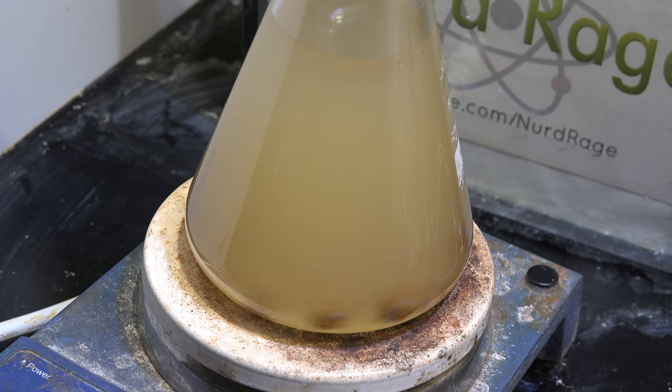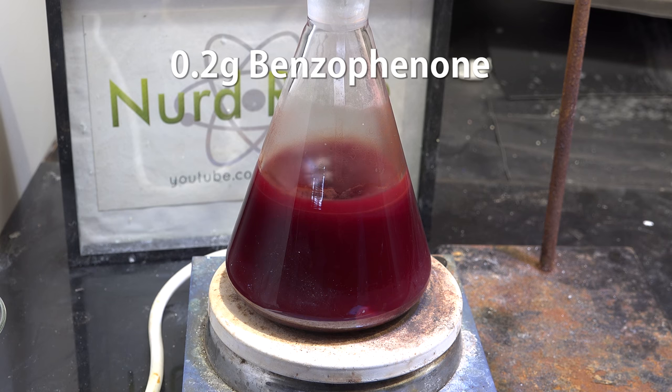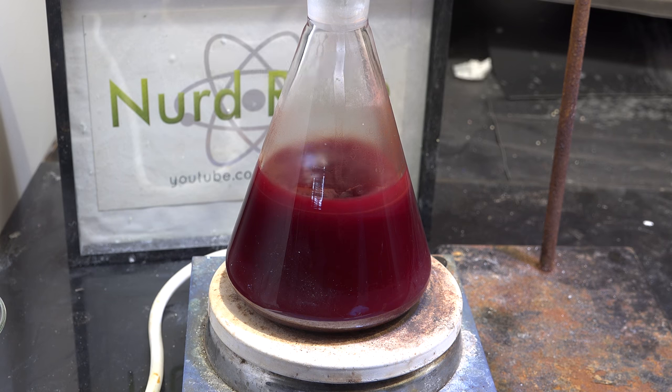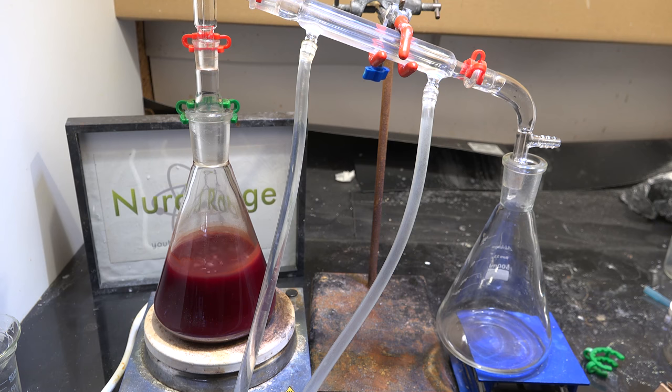Keep stirring for as long as needed to destroy all the impurities. For professional chemists they add an indicator which is benzophenone. Benzophenone reacts with sodium to form a green, blue, red, or even purple solution once all the water and reactive impurities are destroyed — the color is dependent on the solvent. Benzophenone in ether tends to form red or purplish colors. Unfortunately for amateur chemists, getting benzophenone is not easy, so we're going to need another indicator.